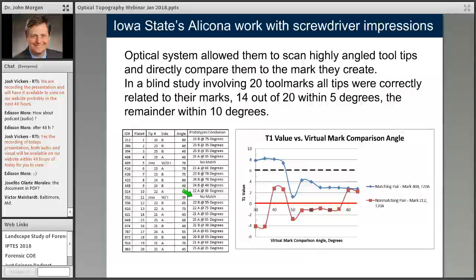And that's really interesting from a tool mark examination perspective, to be able to not only say this screwdriver made the mark, and within a certain plus or minus of the degree of attack of the screwdriver in question or other tool mark, but also to be able to say, hey, there's some objective basis for why this particular match was occurring, and some objective basis for how accurate that match is. That's in some ways, I think, going to be very valuable for us long term in terms of the validity of the tool mark examination process.